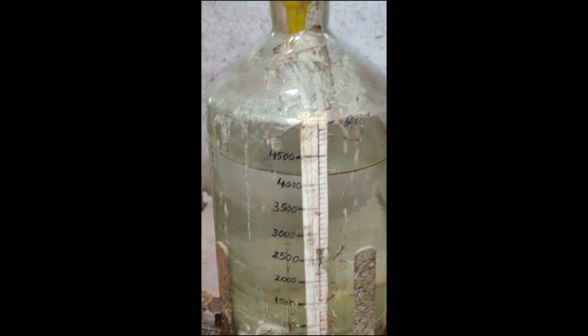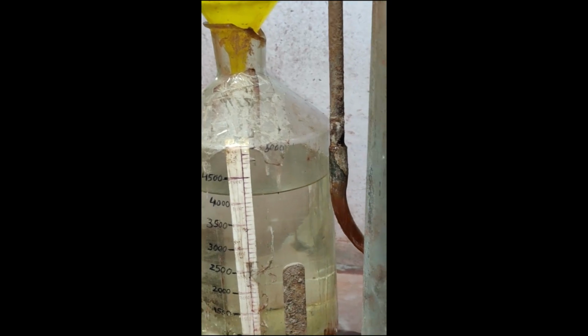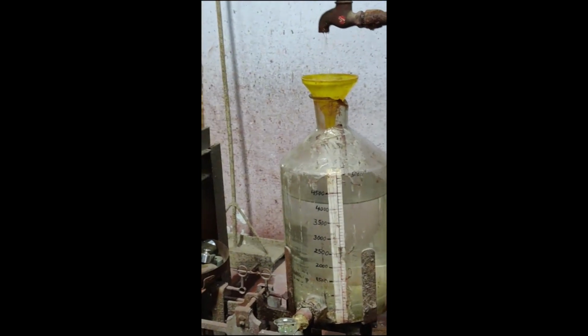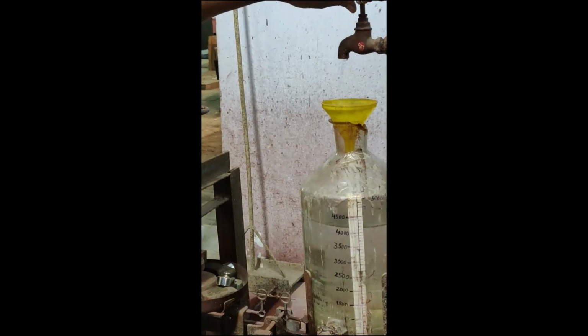Now we are filling the water. Before that we have to take the initial reading. Initial reading we are taking. Same procedure, just we are filling the water and applying the force on the plate. And observe the pellet breaking.